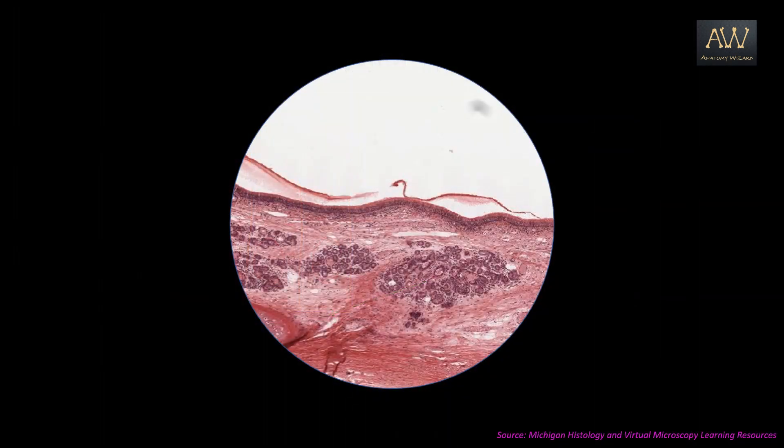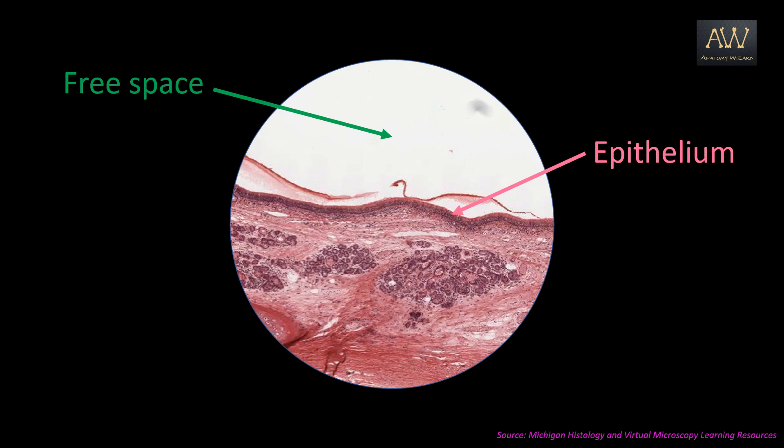Now as the epithelial tissue forms a selective barrier between the external environment and the rest of the tissue, it is always adjacent to some free space. This slide shows the free space edges into the layer of the epithelial tissue, visible as the darkly stained layer on the edge of the tissue.